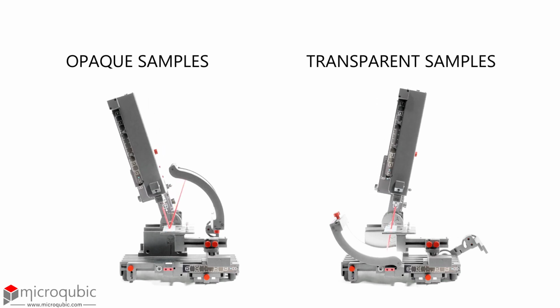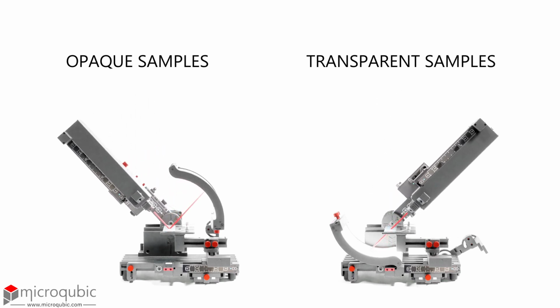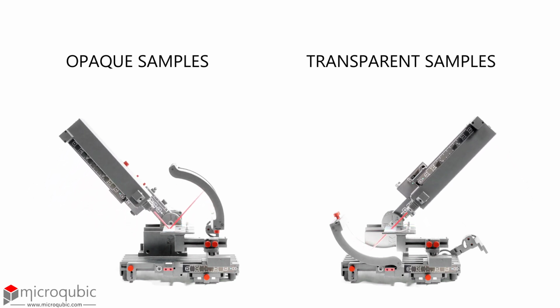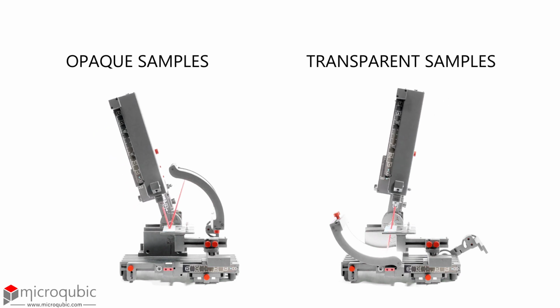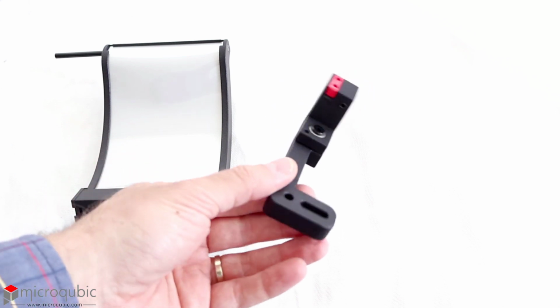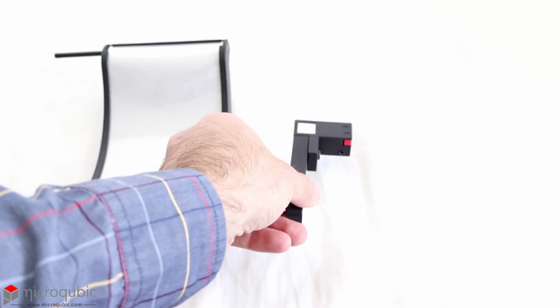Hello! This in-depth video tutorial will provide you with more details about the illumination sources of your microscope and its imaging modes. The system has multiple illumination sources for different imaging scenarios. Curved illumination is essential for imaging reflective and opaque samples from various angles. Spot illumination is used to apply higher intensity light to specific locations.